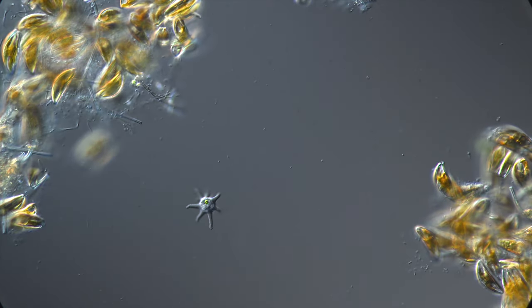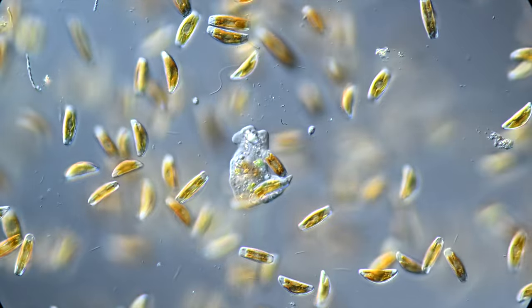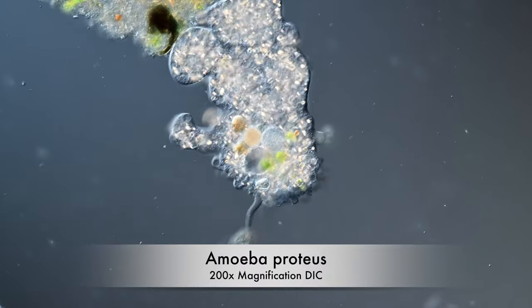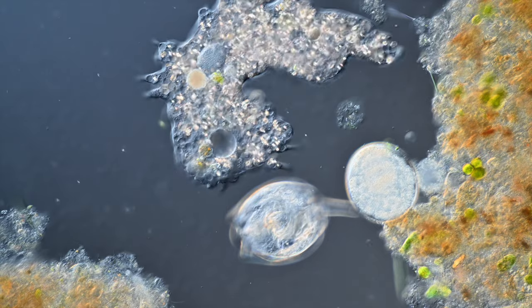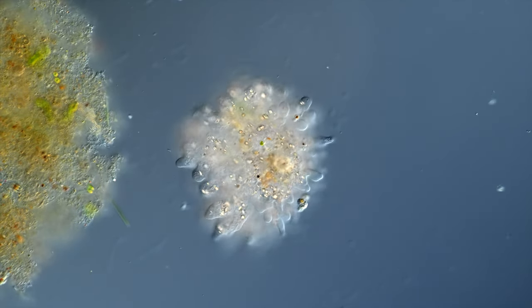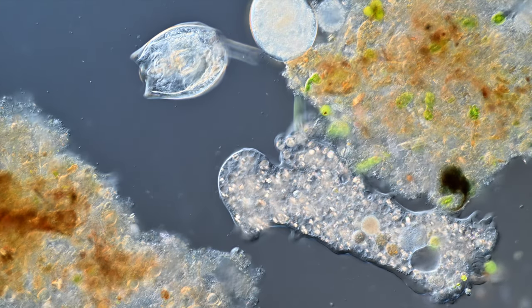There are thousands of different amoeba species, but today I want to show you how you can grow amoeba Proteus. This amoeba species is abundant, relatively big, and easy to cultivate. Are you intrigued? Let me show you how to grow them at home. Please be aware that culturing amoebas takes several weeks, a lot of patience and experimentation. So don't get frustrated. Hang in there.